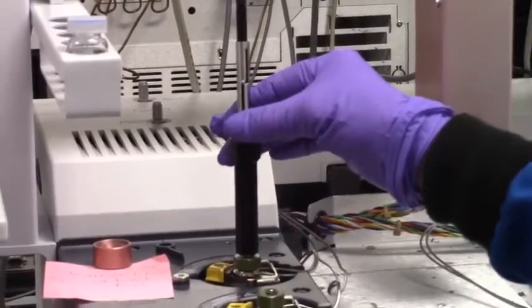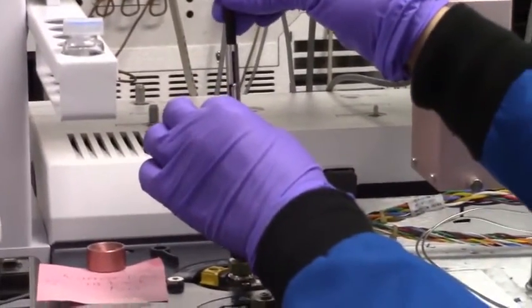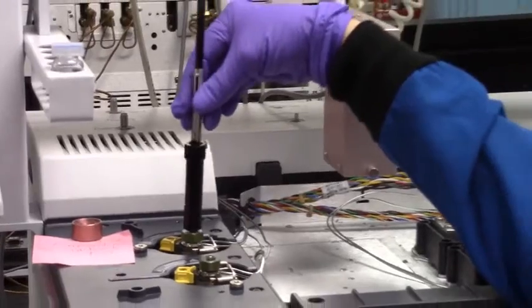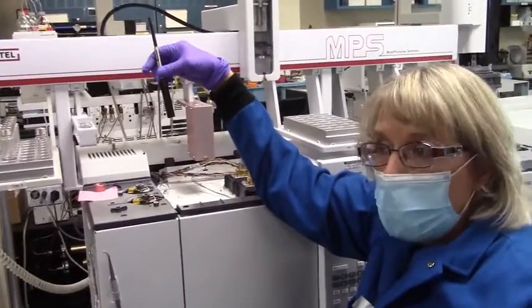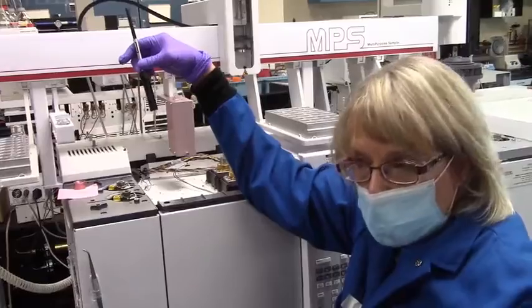Now I'm going to take it out of the inlet, and one thing to always remember when you're doing manual SPME: retract the fiber back into the needle before you take it out of the inlet. Otherwise you're going to destroy the fiber. So I've just done that by pulling up on the plunger, and now I can safely pull it out of the inlet. So at this point then I'm going to go over and set up my sample, and I'm going to get it ready for headspace sampling.